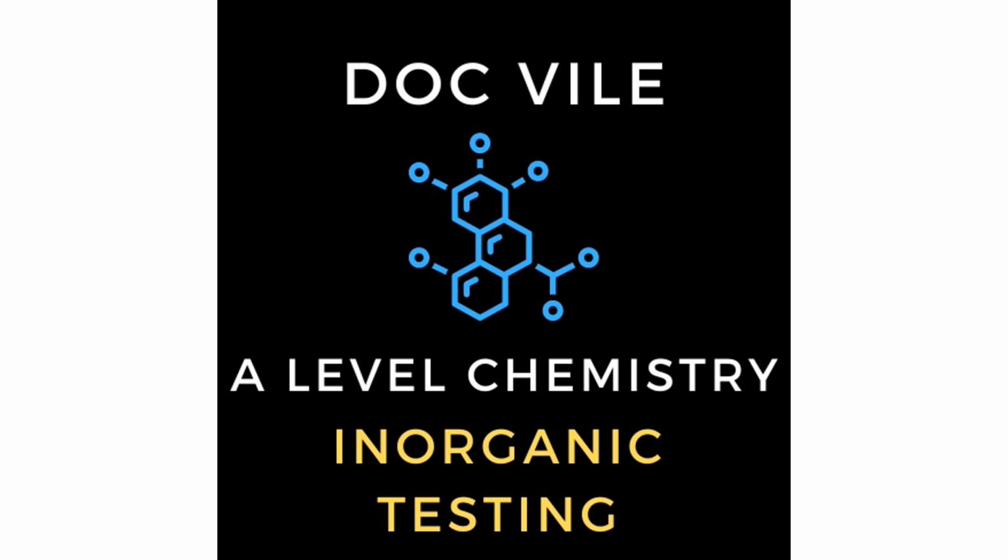With that in mind, this video is going to focus on some of the inorganic tests, so testing for metal ions, testing for non-metal ions, and so on. It's not going to be exhaustive, but we'll cover some of the main ones, and perhaps I'll put together another video at another time that covers some of the other remaining content.